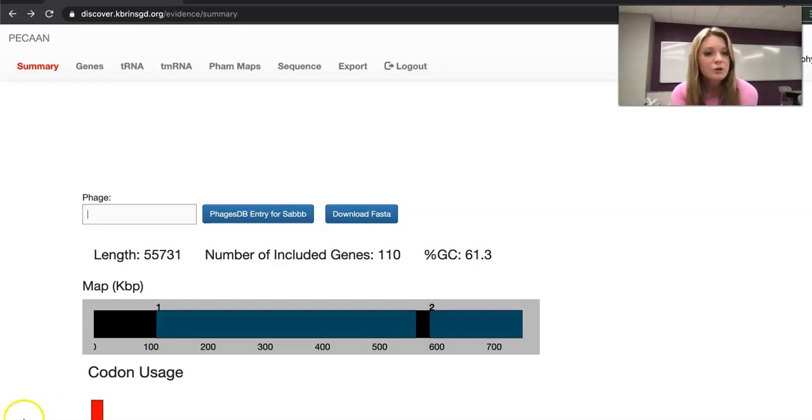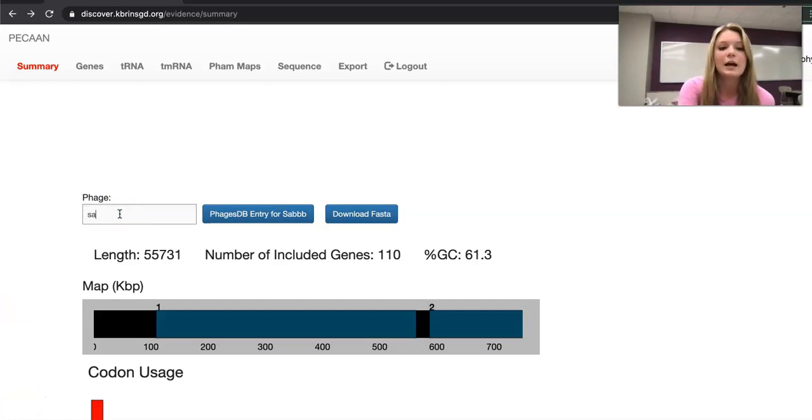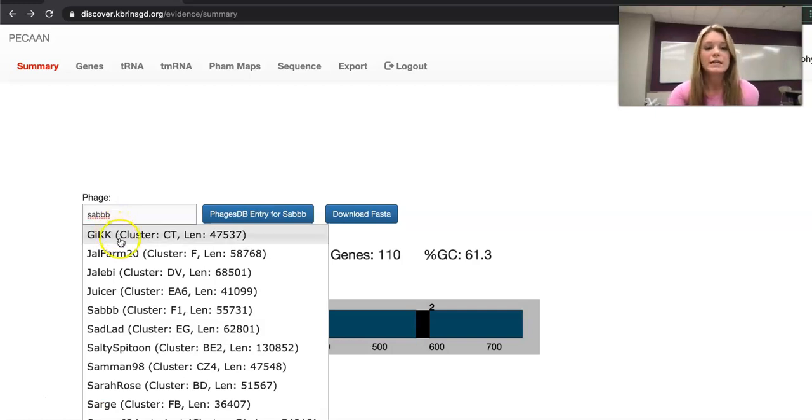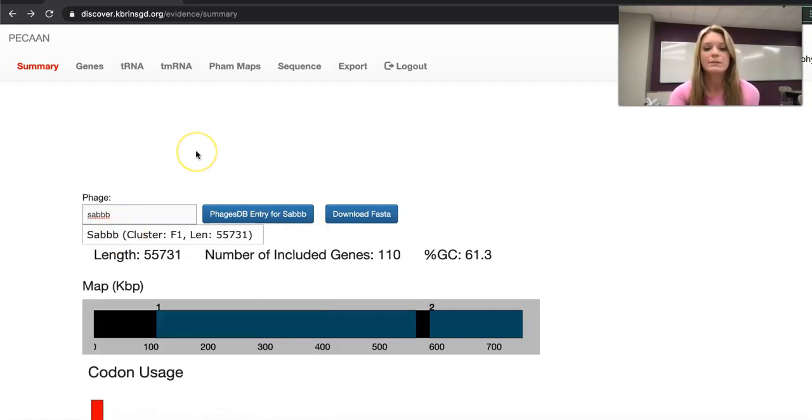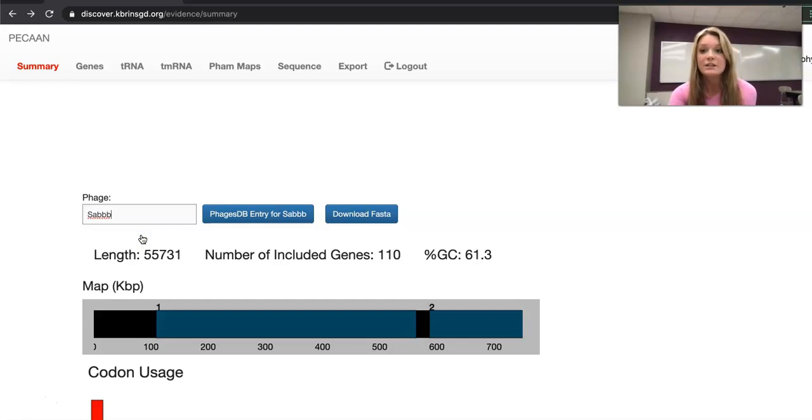First we're going to show you how to select the phage that you'll be working on. You're going to go to this phage box, type in the phage that you want to look at, Sabbb, and then once it pulls up, it might take a minute, select the phage you want to look at which is Sabbb. You've now selected the phage that you want to look at.